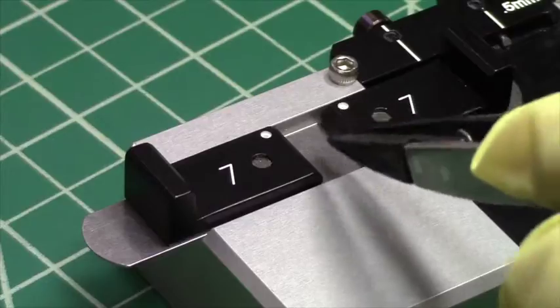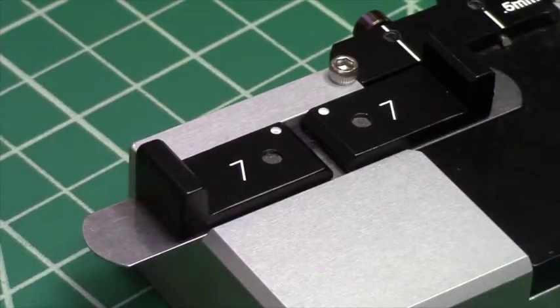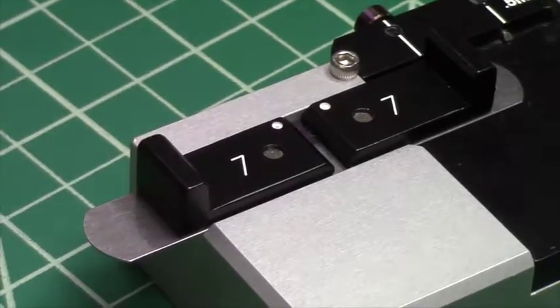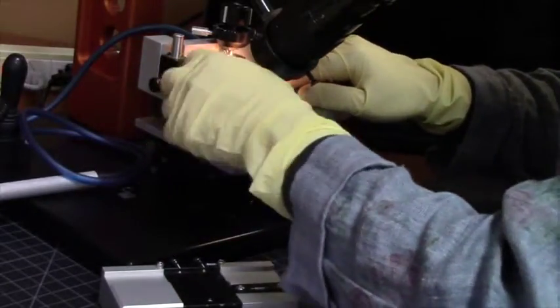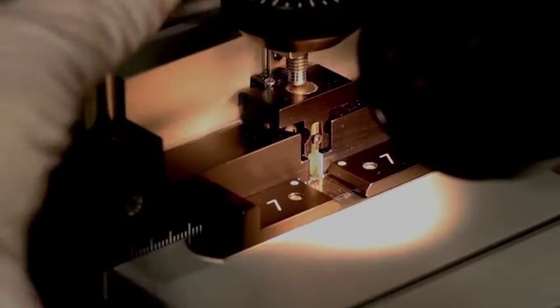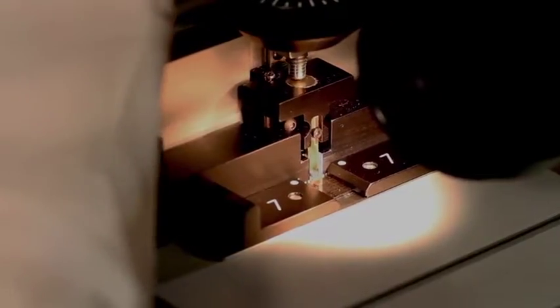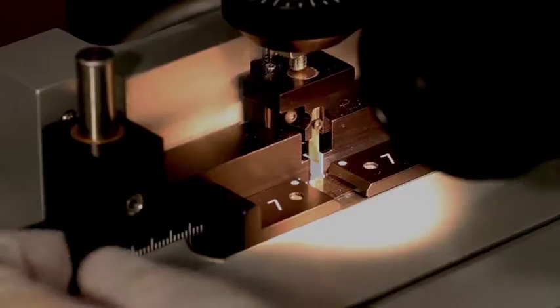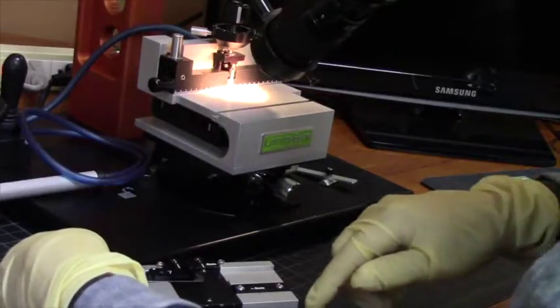Let's review the process once more. We load the sample into the hold down, then transfer the sample to the Lattice X for indenting. I'll now indent the sample on the Lattice X, then remove it from the Lattice X and put it back on the small sample cleaver and cleave with the small sample cleaver.